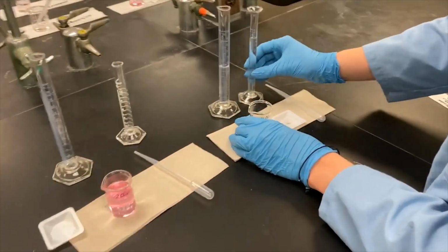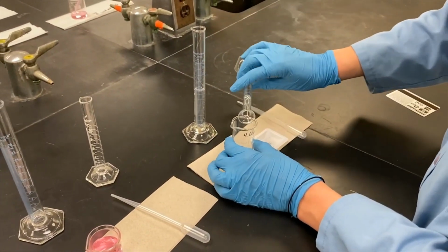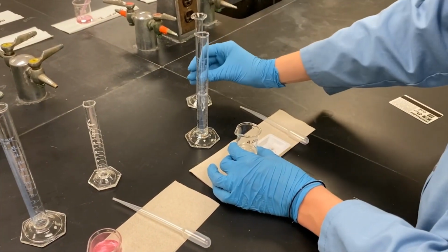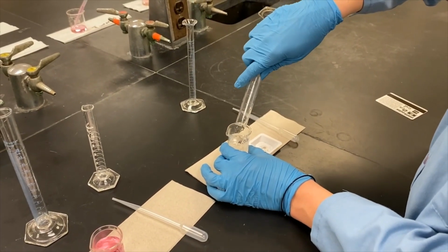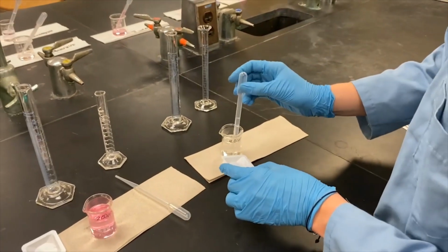The last one we're going to go ahead and do is the 4 ppm solution. So we are using 10 milliliters of our stock solution and 15 milliliters of water. Add that DPD.